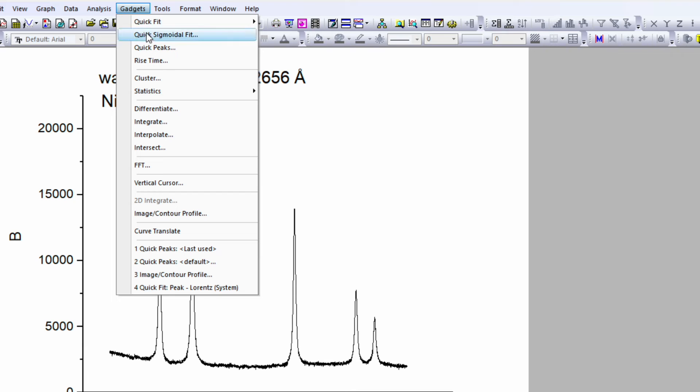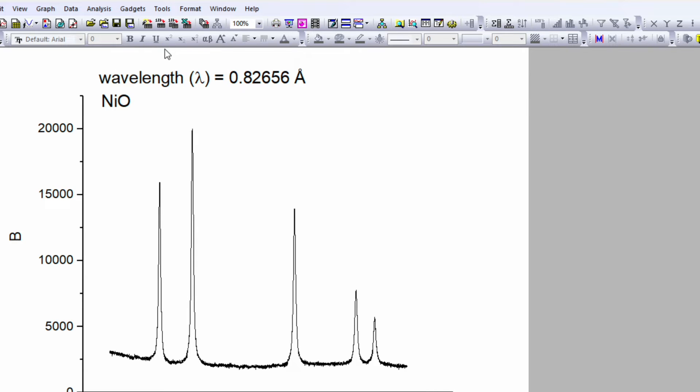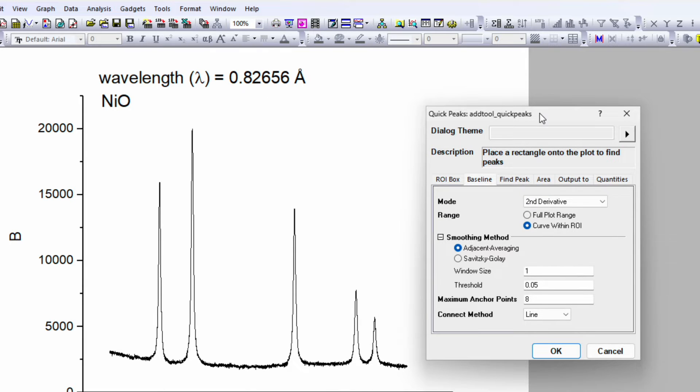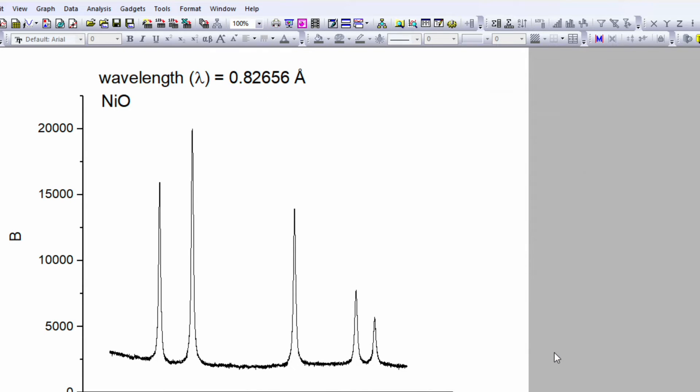Go and click on gadget. Go to the third option, click on quick peaks. A new window will pop up. Simply click on OK.